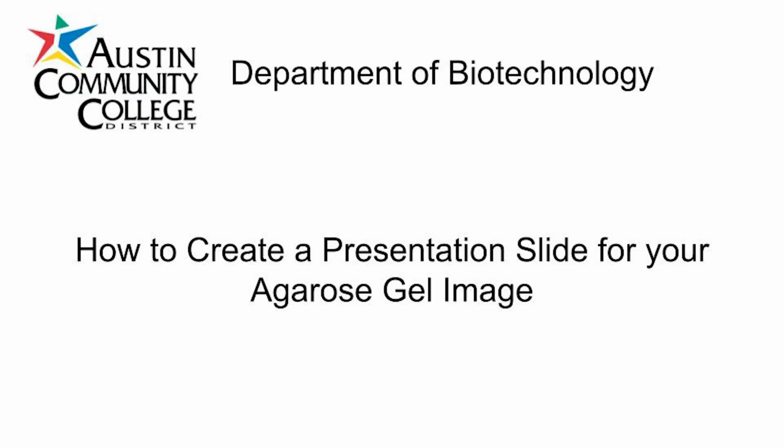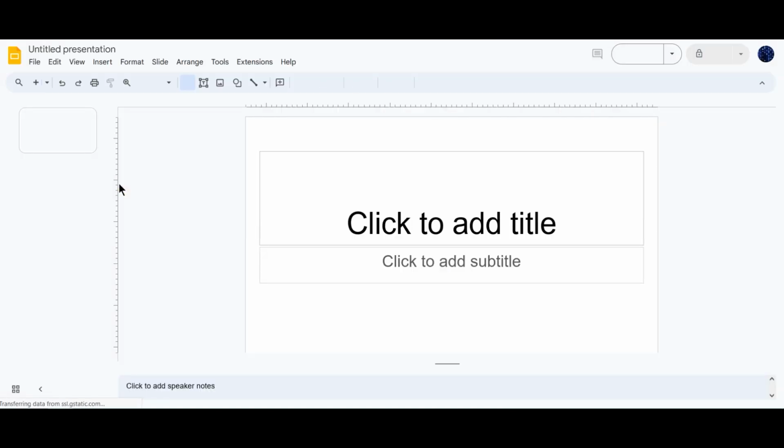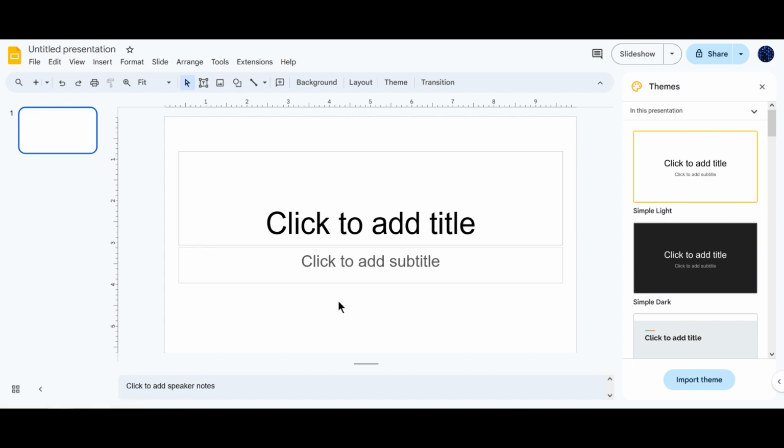Hi y'all, today we're going to give you a quick tutorial on how to create a presentation slide for a gel image. So the first thing we're going to do is open a new Google Slides document. And here we see the default slide.